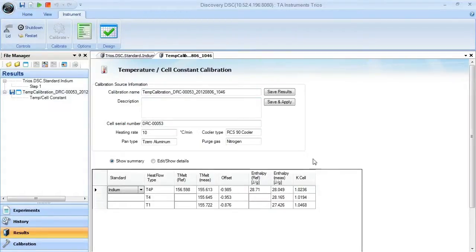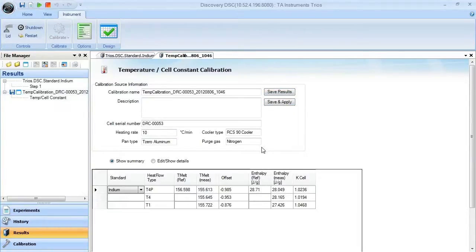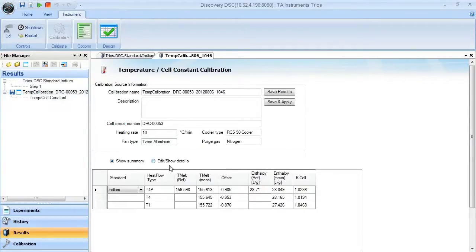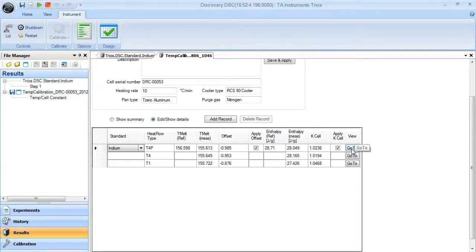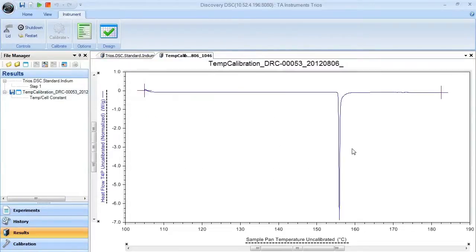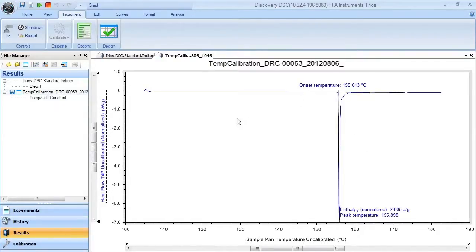You can save and apply this or just save the results to be applied later for calibrating the DSC. If you'd like to see how this particular data set was analyzed by the software, choose Edit Show Details, then hit the Go To button, and it will open up the plot and show you exactly which data limits it used and the values it collected from that run.